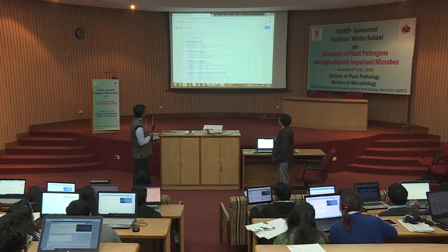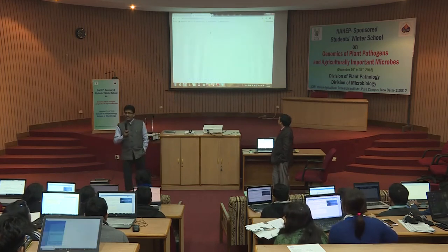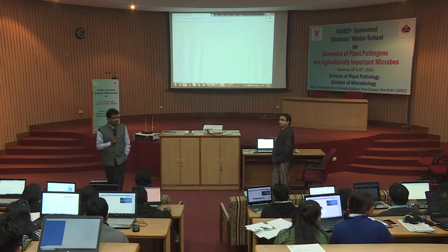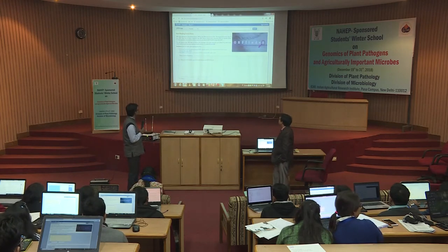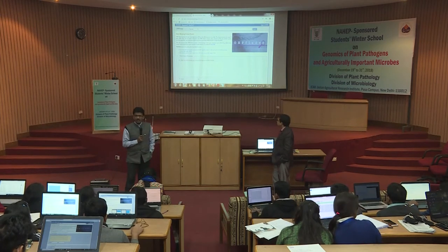So in the ORF finder, you have copied your sequence, I think. Everybody has the sequence downloaded, correct? Okay. Keep it ready now, in FASTA format. Always keep that sequence open, because many times you have to copy it and do analysis. So this is the ORF finder, which is a service provided by NCBI.